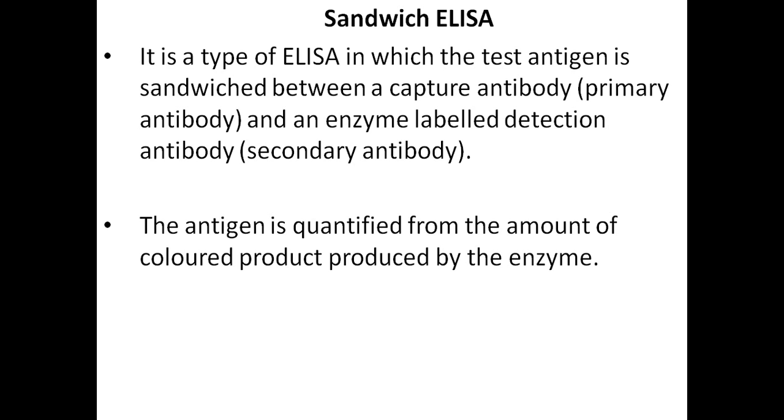This secondary antibody is linked to an enzyme. The secondary antibody and primary antibody trap the test antigen, and that is why this is called sandwich ELISA.